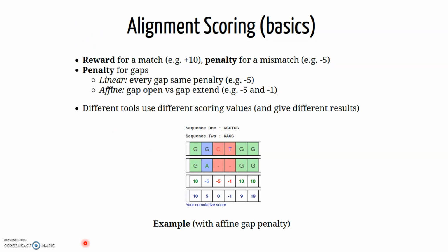And so remember that all of our sequencing-based aligners are going to align to our human reference in this case, or whatever our model organism tends to be. So this can be mouse in a lot of research. This can be yeast. This can be any other type of model organism that has had the genome sequenced.